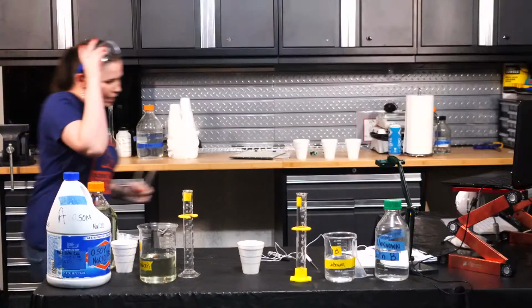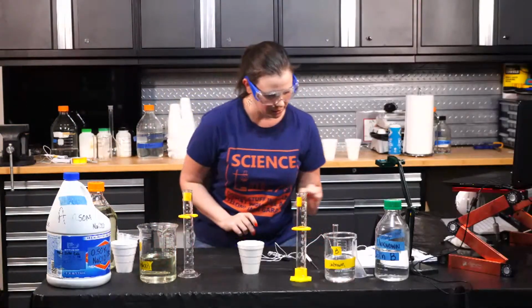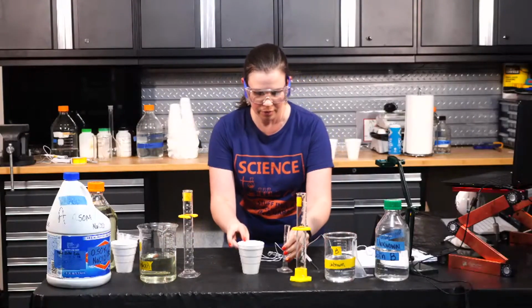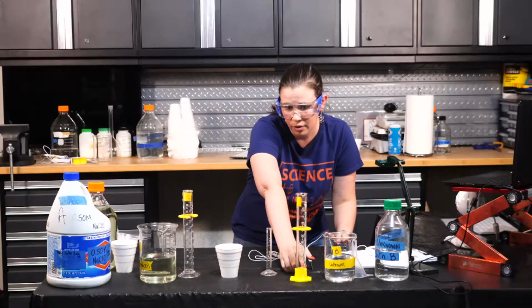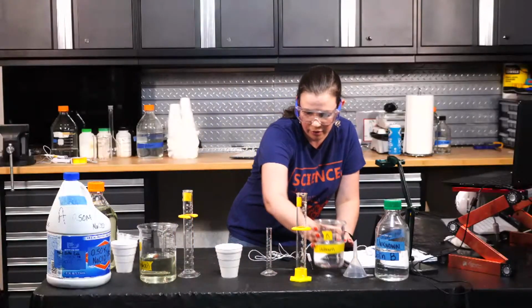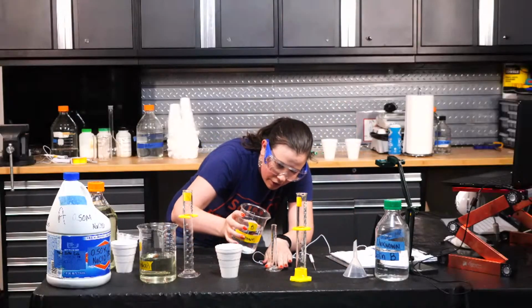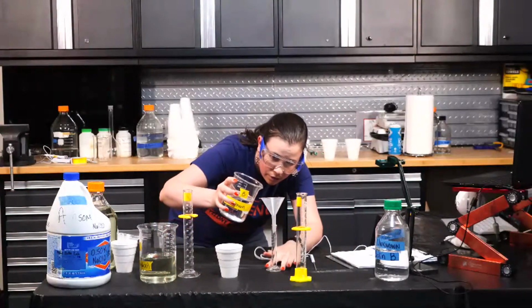Okay, don't run in the lab, right? Got it. 10 milliliter graduated cylinder. So we have 45 of the bleach in. We need 5 of solution B. Because there are no markings under 10 milliliters on the 100 milliliter graduated cylinder, we're going to switch over to the 10 milliliter one and do 5 milliliters. Actually, I'm going to use my funnel too so I don't spill.